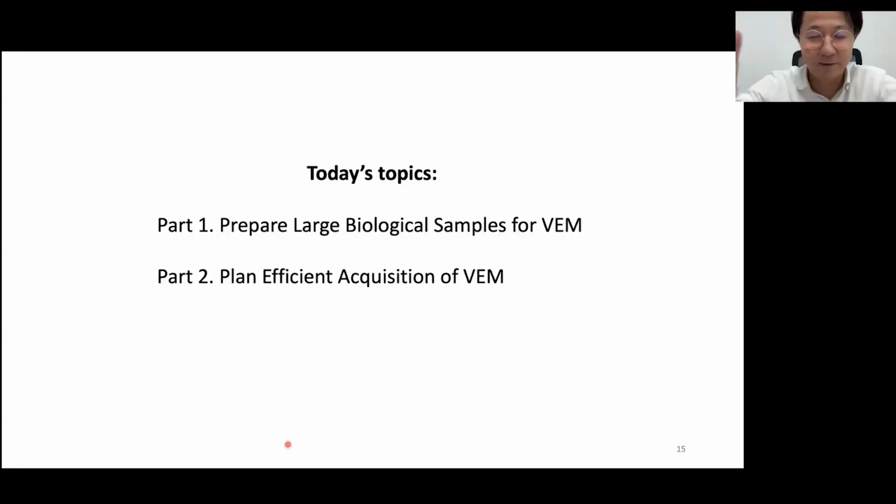I promised Nicola a month ago that I would put it on bioRxiv, but things got delayed. We are still testing different buffer combinations, because we don't want to use CAC buffer, it's highly toxic. We want to find a replacement for that, and we still want to make it easier.